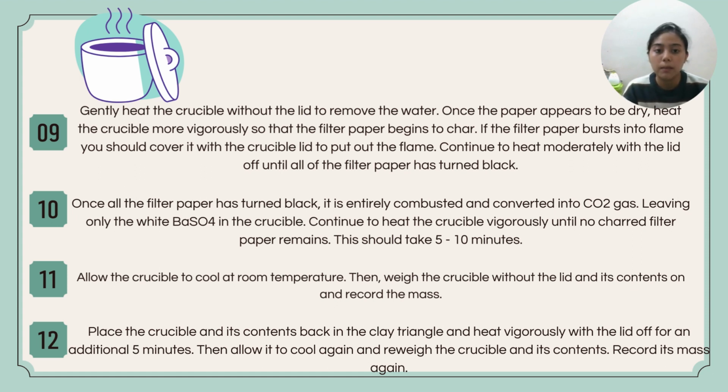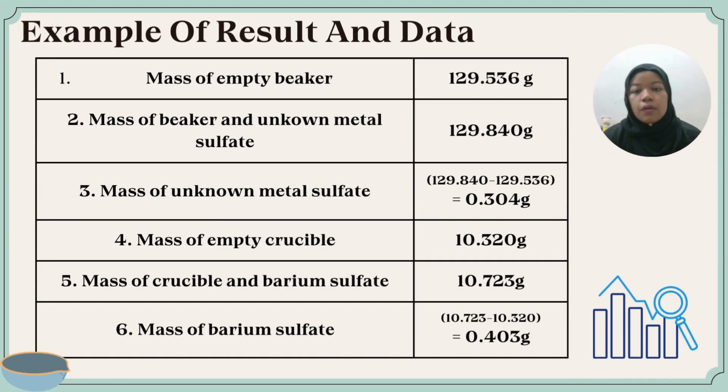Finally, place the crucible and its contents back in the clay triangle and heat vigorously with the lid off for an additional 5 minutes. Then allow it to cool again. Reweigh the crucible and its contents. Record its mass again. Next is the example of results and data.